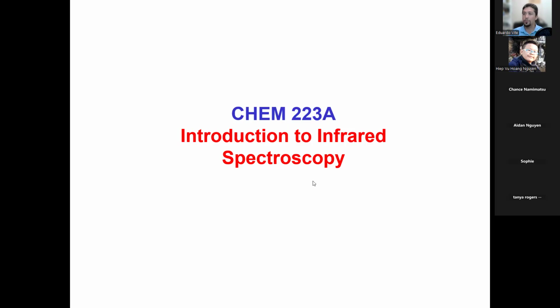One of your pre-lab quiz questions was, what does IR stand for? Infrared radiation. We use infrared radiation spectroscopy, but we just call it infrared spectroscopy.